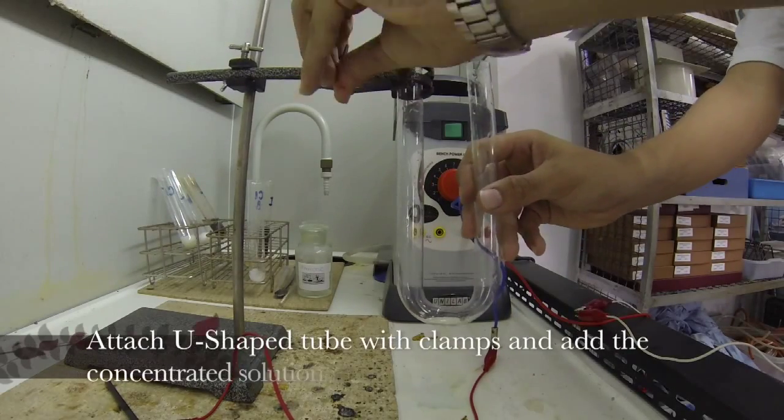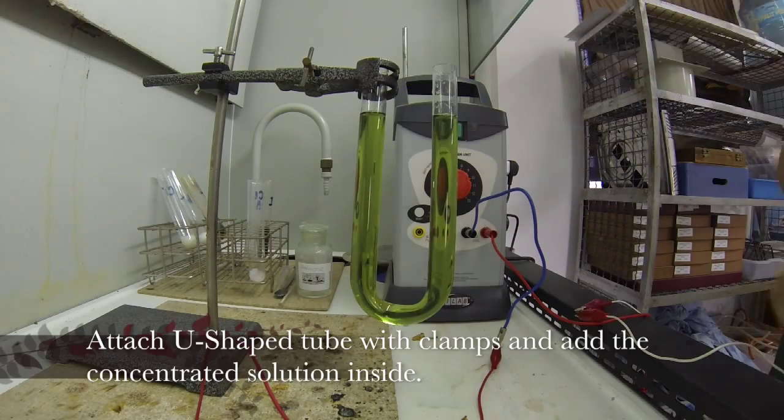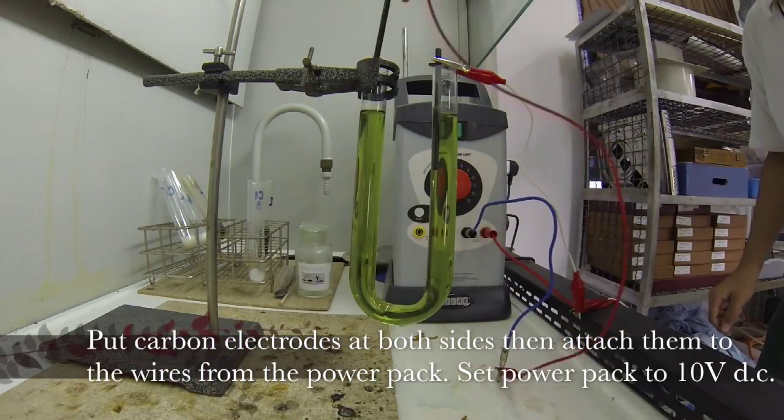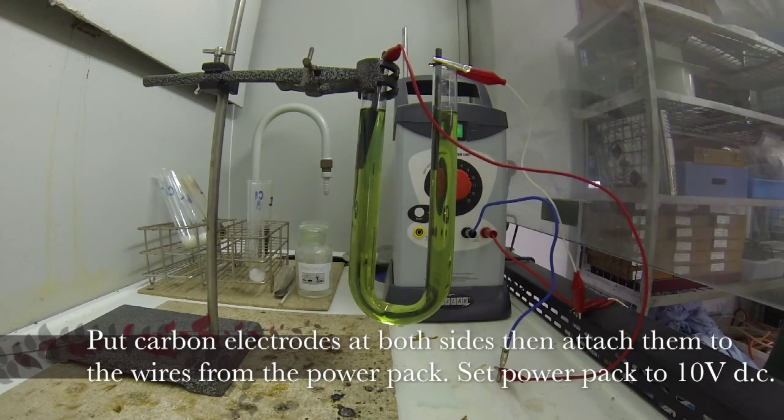Next, attach the U-tube with clamps and add the concentrated solution inside. Then put carbon electrodes at both sides, and attach them to the wires from the power pack. Set the power pack to 10 volts direct current.